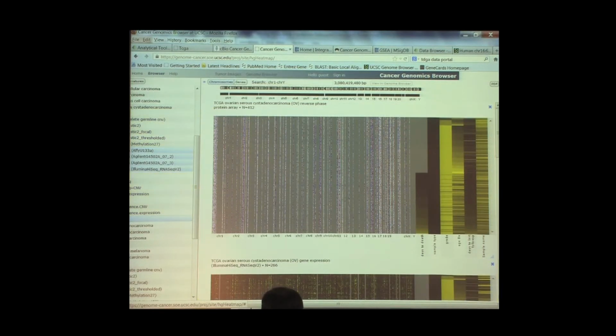Okay, so you should be looking at something like this. You won't have this column yet. I have it because I've been in here, but you won't have this column. So let me explain a little bit about these data. They're controlled here. You have 3 different options. You can look at a heat map, you can look at box plot, and you can look at proportions. You can change your coloring.